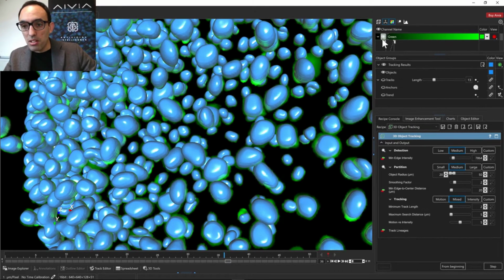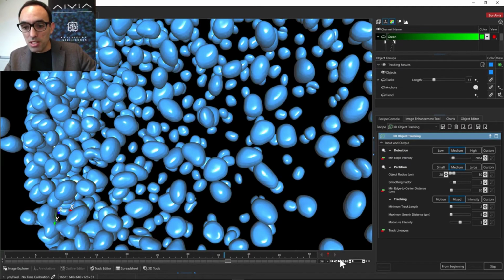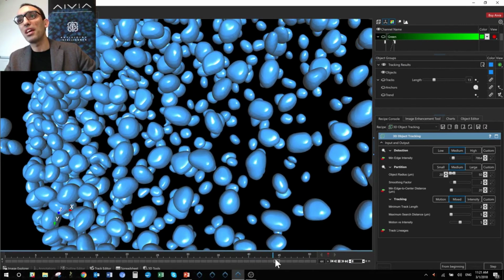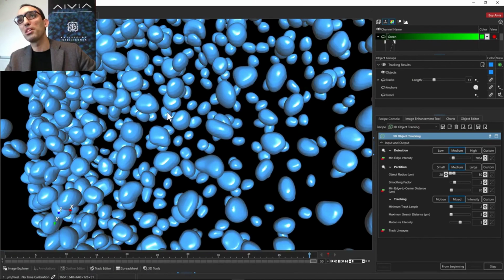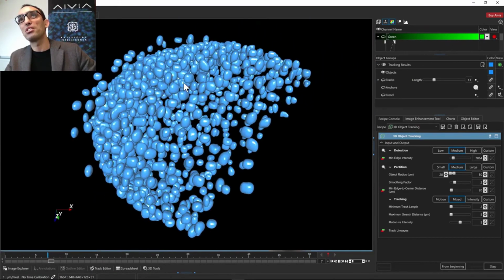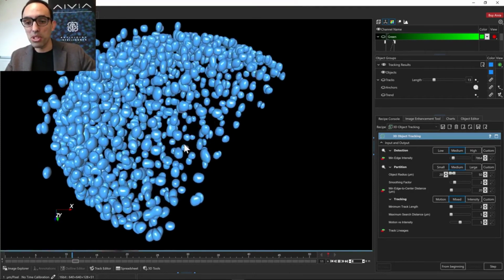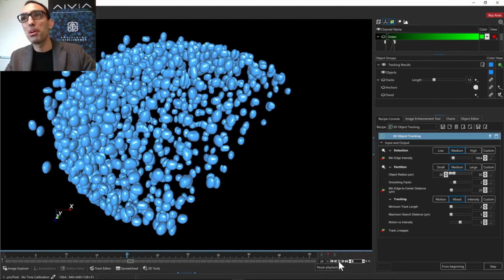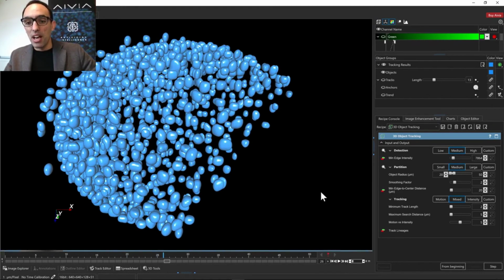And we can show then this playing through time. As I showed earlier, it takes less than a second to progress between time points, but then it gets faster as it caches. Currently, all these objects are colored in a single color. I can color them any way I want. I'll get there in a moment.